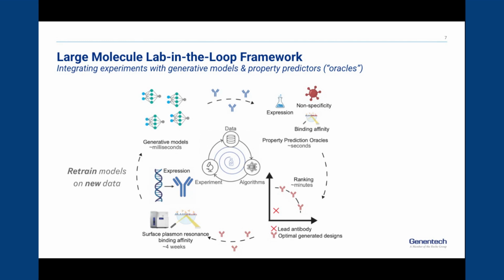The second thing I want to highlight is this thing that is written right below the experimental characterization, which is the timeline. The whole loop now, we get the results back from the lab in about 4 weeks with a lot of things streamlined, and this whole process takes now 4 to 5 weeks, the entire loop to start from the seed and get an antibody.